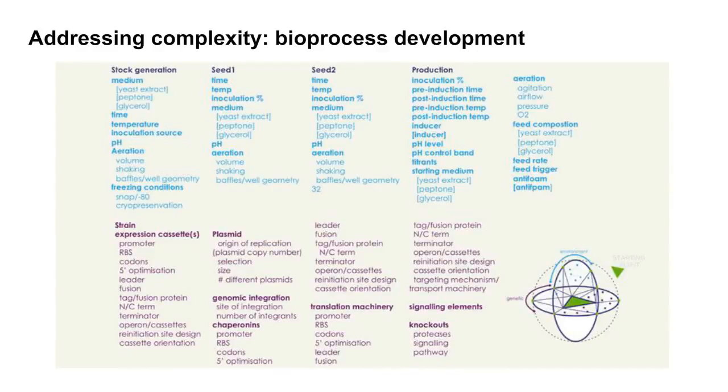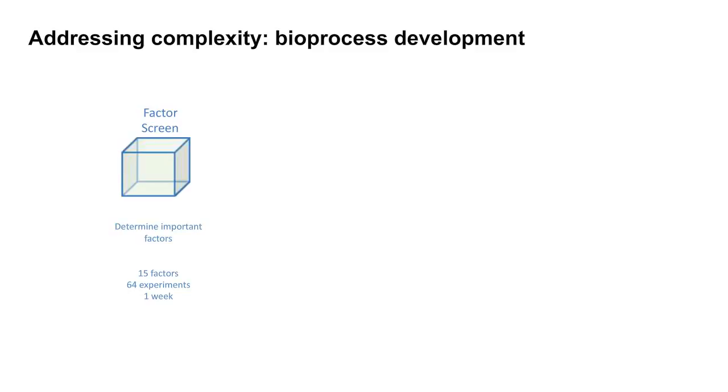So how can you go ahead and unpick the high-order interactions that are going on in a system like this? Well, in our case, it's iterative multifactorial experimentation. So we'll start with a process that we call a factor screen, where you're casting a broad net. Now, this is an example from, for us, 4 years ago when we were still trying to do this stuff by hand. And believe me, you really don't want to be that guy.